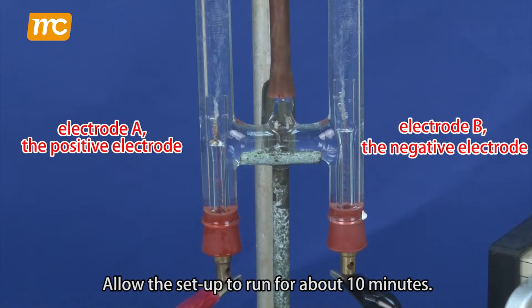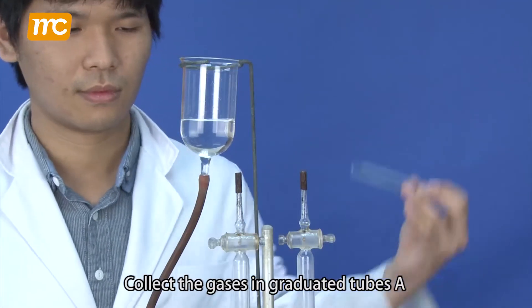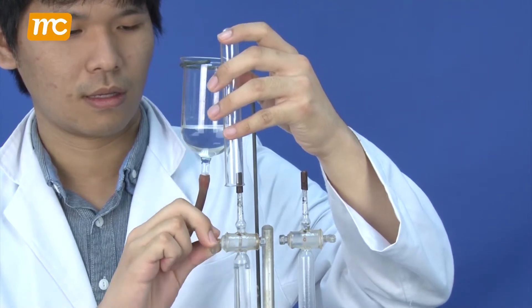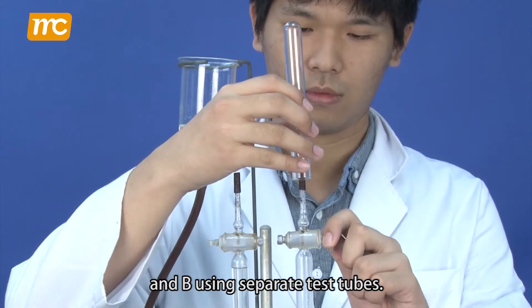Allow the setup to run for about 10 minutes. Collect the gases in graduated tubes A and B using separate test tubes.